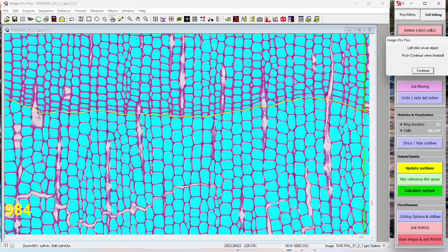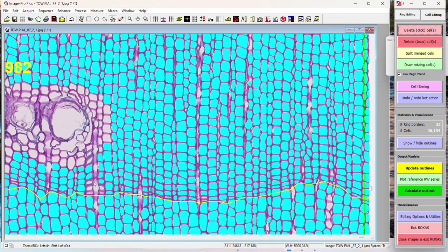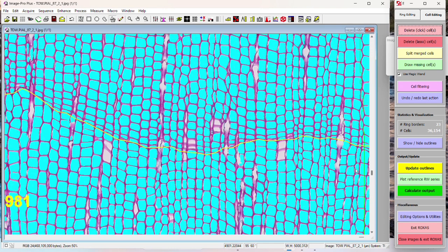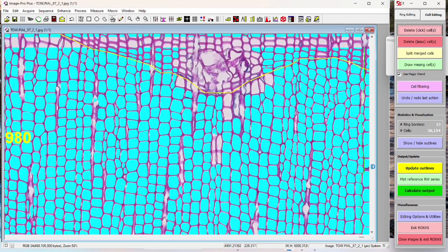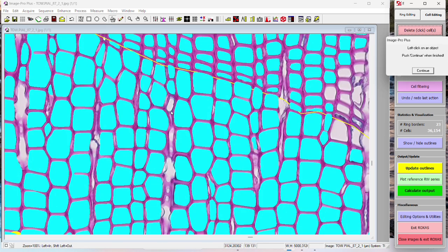A lot of times it feels a bit subjective because you'll have rays that emerge and then disappear again, and it's not the ray actually ending, it's just how it's emerging or manifesting in this image. And so sometimes you'll have a pretty clear ray like this, and then it turns into cells, and you don't always know when you need to stop deleting or when the cell is inappropriate or if it's actually correct. In this case, I would say it's not, but then it goes away right here. But sometimes, like if we go up a bit, this one looks like the emergence of a ray, or this one does, and then it becomes cells. And once you actually see cells within the ray, with actual shapes and cell walls, then that's probably when you need to stop clicking.